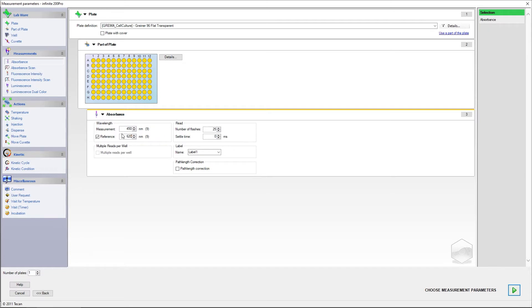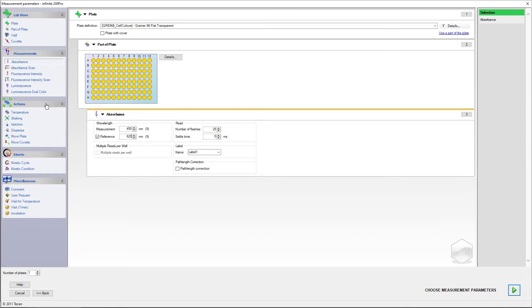Define other measurement parameters such as shaking, settling times, or plate movements according to your assay protocol. Click Choose Measurement Parameters to enter the Magellan method wizard.